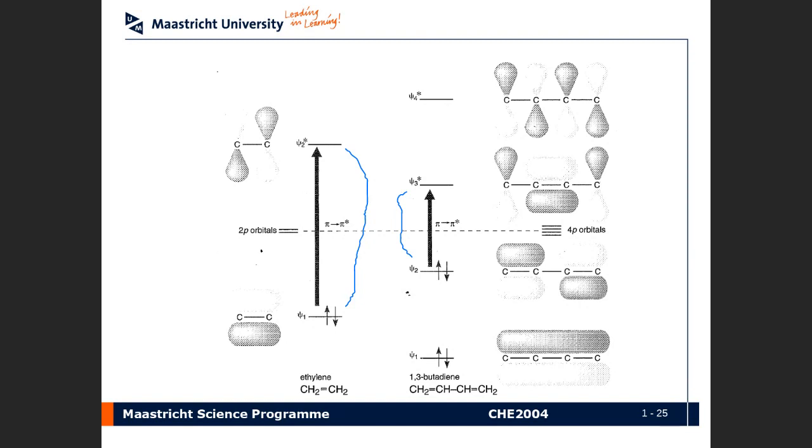And if I have, for example, if I've put on another double bond, right, and I conjugate it further, that pi to pi star transition is going to get even smaller, right? So this is a very interesting effect where you can actually elucidate the degree of conjugation in UV-Vis spectra, okay, for organic compounds in a homologous series of them. And, you know, this has got something to do with molecular orbital theory and stabilization, okay? You kind of see that depicted here, right?